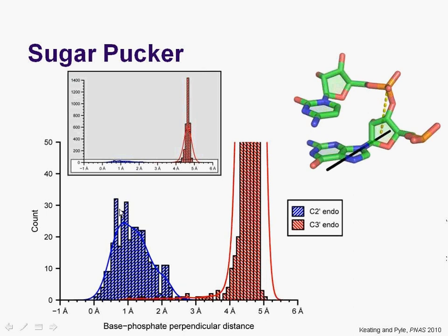I should note that this technique is the same thing that's used in MolProbity. So if you feed an RNA structure into MolProbity, and it tells you that you have 11 sugar puckers that are questionable, it's using this same metric. I can't take credit for this. This was developed in the Richardson lab, and as you can see from the plot, it works very, very nicely.